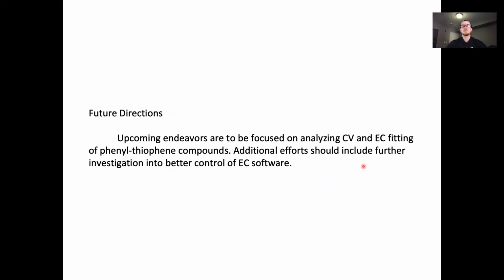So thank you so much for listening. Our future directions for this project are going to be focused on analyzing cyclic voltammetry and using the biologic EC software fitting of phenylthiophene compounds, because the more we are able to do the fitting of more phenylthiophene compounds, that way we can perform the Hammett analysis that I discussed earlier.